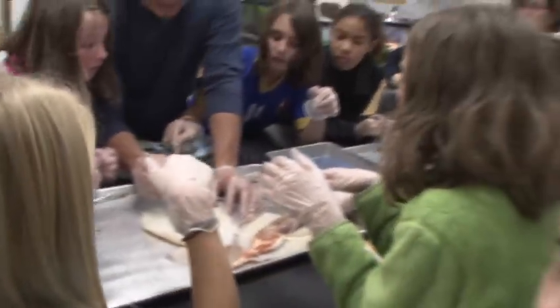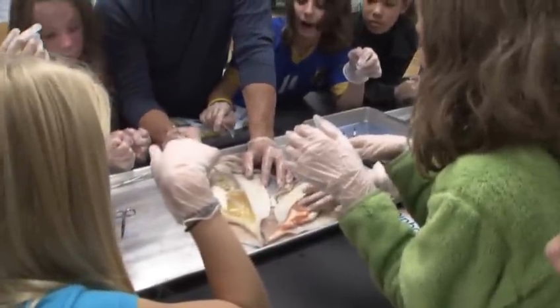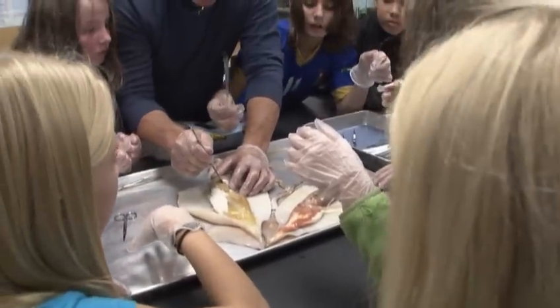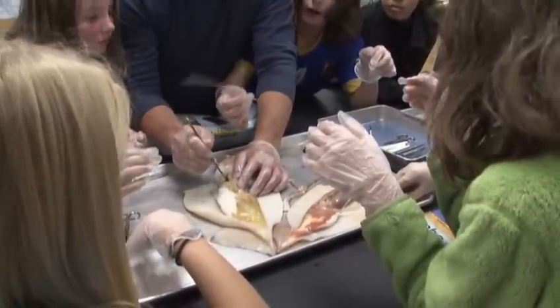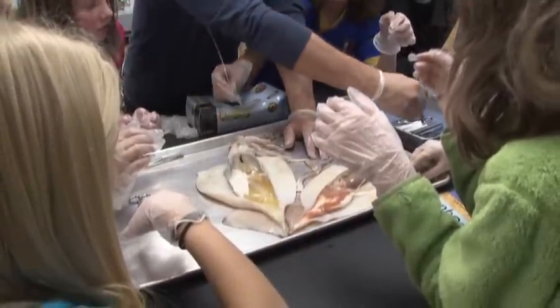Wait, hang on. I'll open it up. Watch your fingers. This looks cool. This is going to be ink. Do you have any ink over there? Oh, Courtney's got a huge ink gland. Whoa. Okay, who's got a piece of paper? Can I see? Here, paper towel. Okay, you write your name right here on a paper towel.